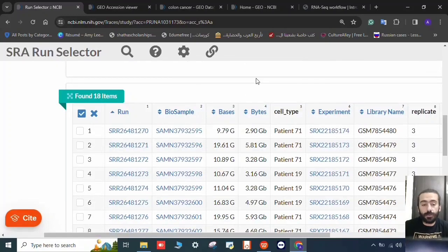So in this video I tried to give an overview of how we can get the sequence. If I want to take just one thing from this video, we need to keep this ID in mind, because by knowing this ID I can get the sequence.